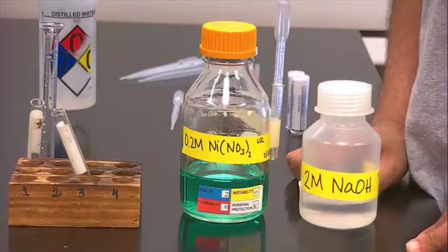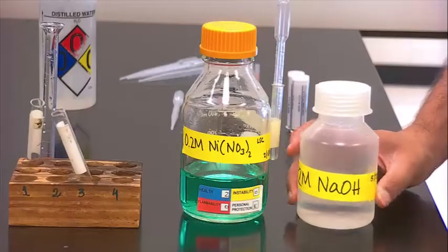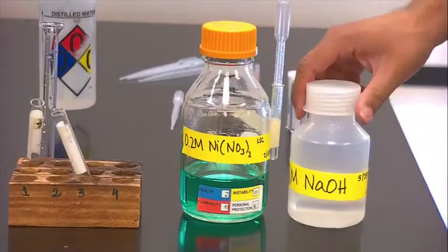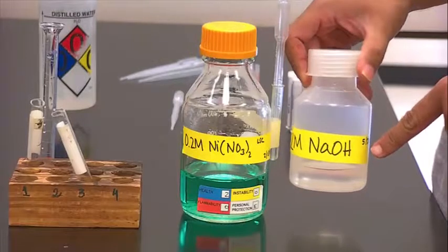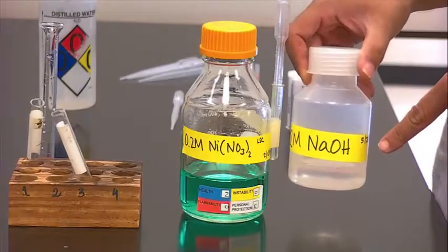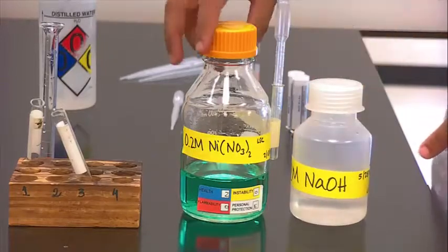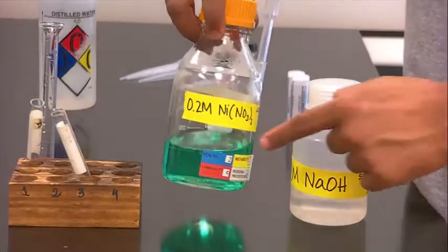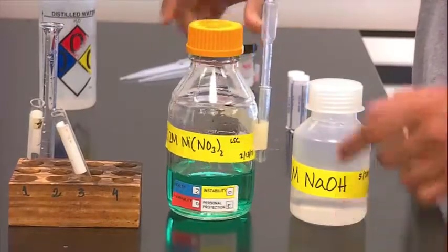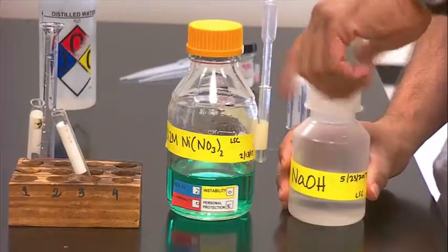For some part of this experiment, you'll be asked to use a centrifuge. Let's show you how to do that. One of the reactions you'll do is 2 molar sodium hydroxide. Remember, M stands for moles per liter. That capital M, it's a unit of concentration. 2 molar. And that will react with 0.2 molar nickel nitrate.